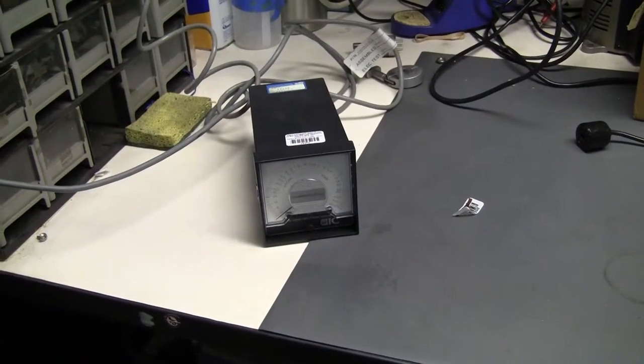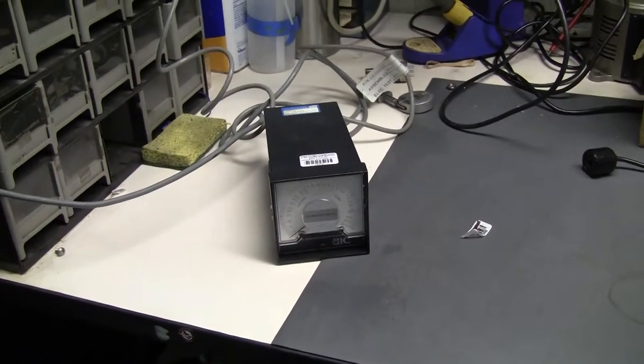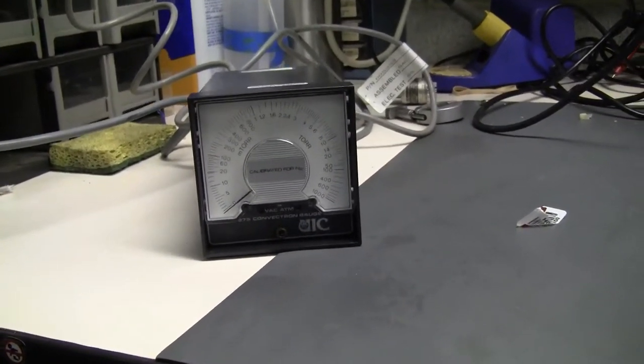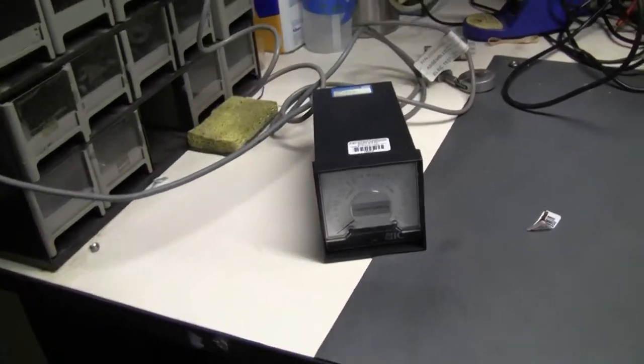Hi, this is Michael from HiTechTrader. Today we're looking at a Granville Philips 275 convection gauge. Let's power it on.